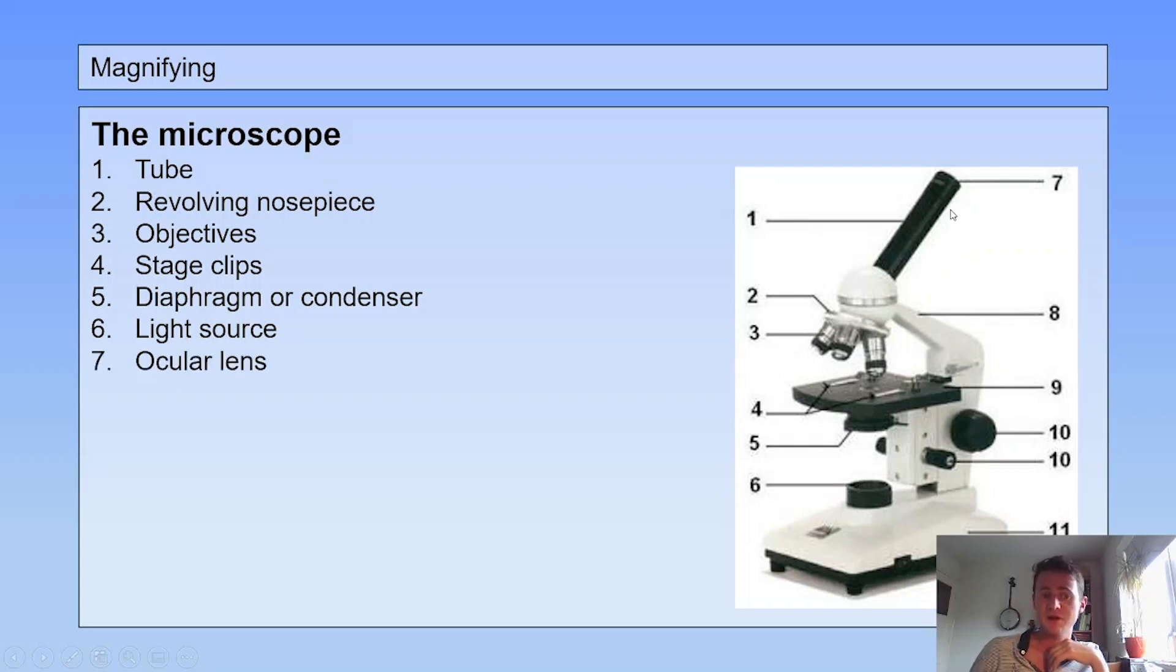Seven, the ocular lens, this is the place where you look through, and eight is the arm. Nine is the stage, so this whole part is the stage, and number ten is the coarse and fine adjustment knob, and sometimes they're integrated in one knob.